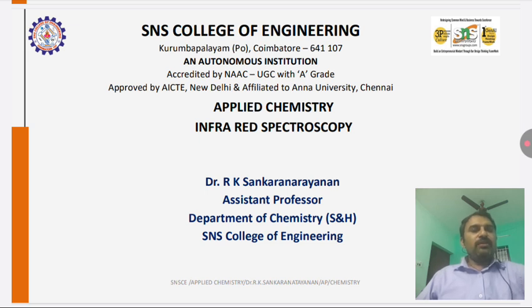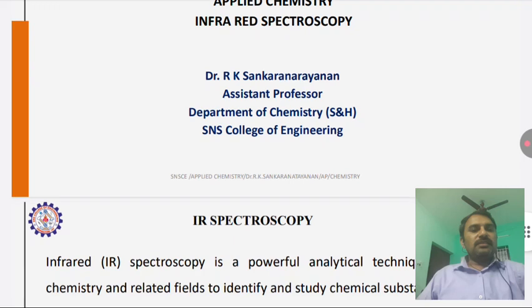Here we are going to discuss infrared spectroscopy. It's related to applied chemistry. Infrared has multiple application fields. What are the rays, where are they applicable, and what are the regions? All these concepts will be involved in the discussion.